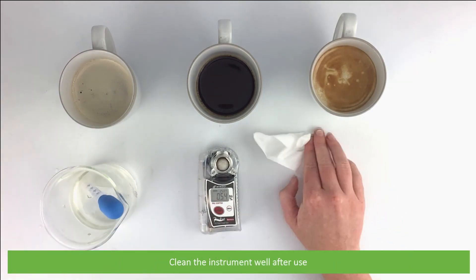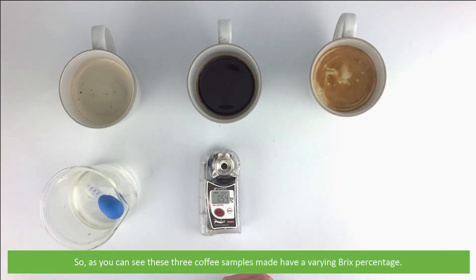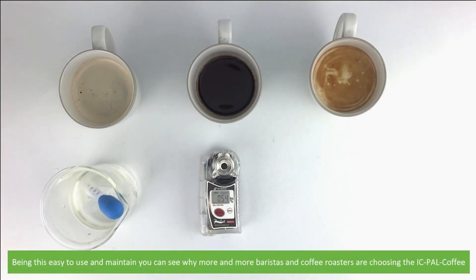Clean the instrument well after use. As you can see, the three coffee samples have a varying Brix percentage. Being this easy to use and maintain, you can see why more and more baristas and coffee roasters are choosing the IC PAL Coffee.